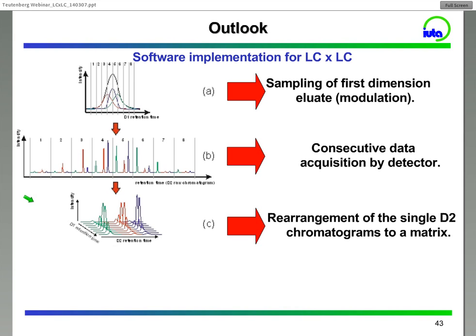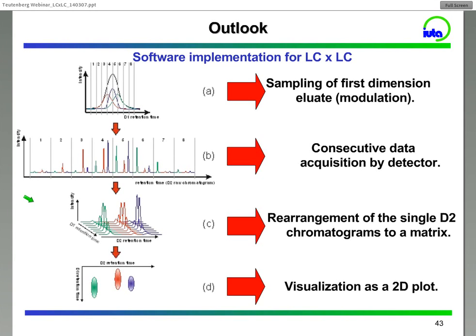And we had to do this ourselves because there was no software available at the moment, so this is very, very time consuming, of course. And the last step is then clearly the visualization as either a 2D plot or 3D plot, and to work with it.